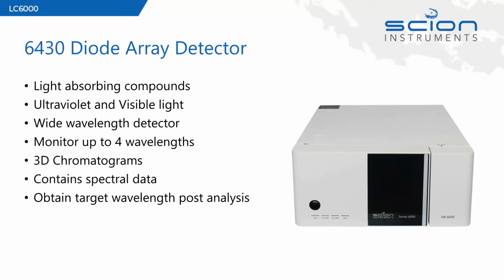And this means we're not just reliant upon the retention time. It gives an extra confirmation that we know exactly what we are looking for is there. So with this spectral data, we can actually build a spectral library within Compass, and this will allow us to search for both known and unknown compounds against a stored reference.